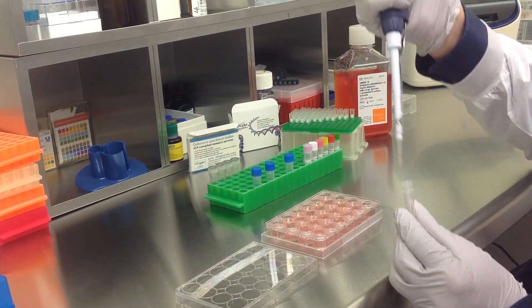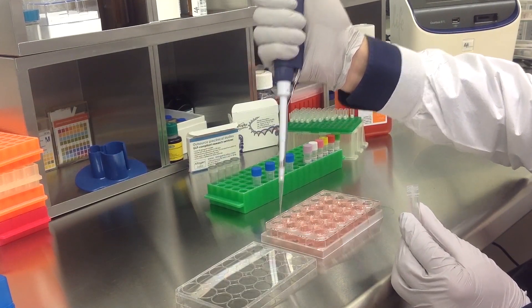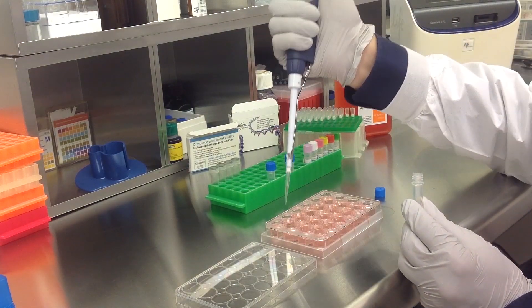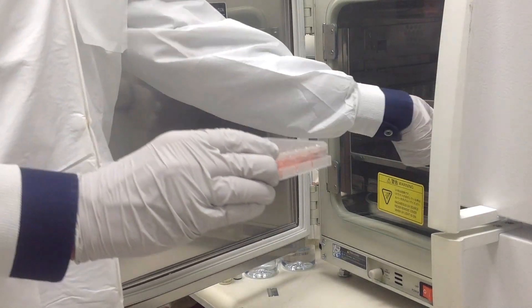Add the prepared transfection complexes to the 500 microliters of complete growth medium. Once you have treated all appropriate samples, incubate the cells at 37 degrees Celsius in a humidified carbon dioxide incubator.